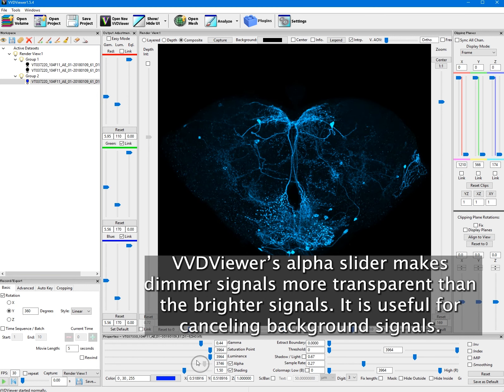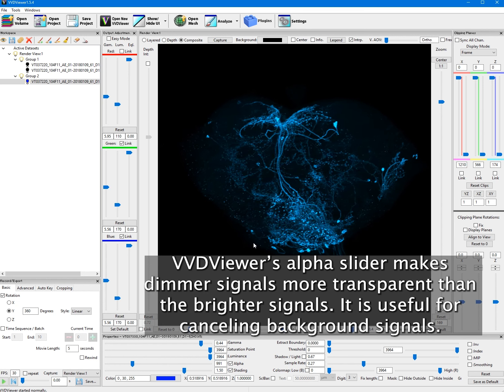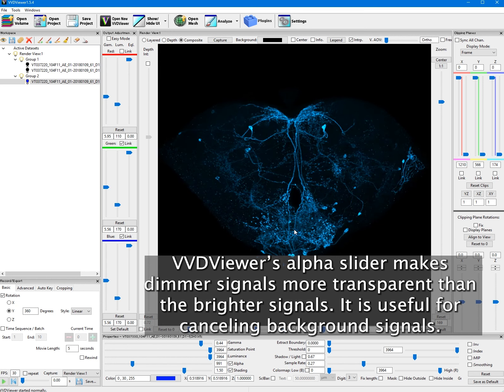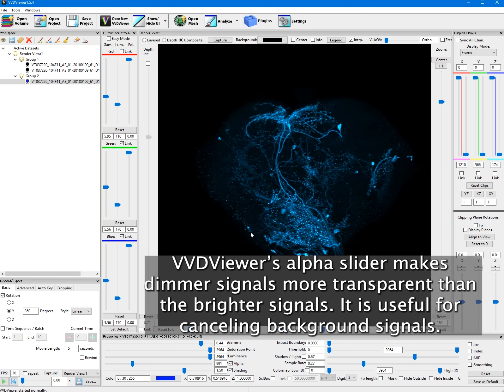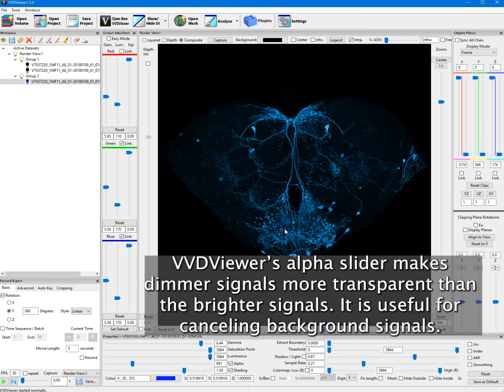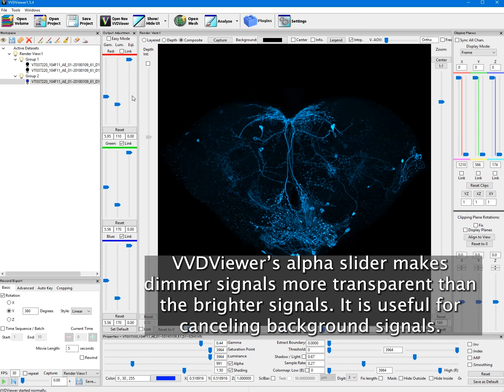VVD's alpha slider makes dimmer signals more transparent than the brighter signals. It is useful for cancelling background signals.